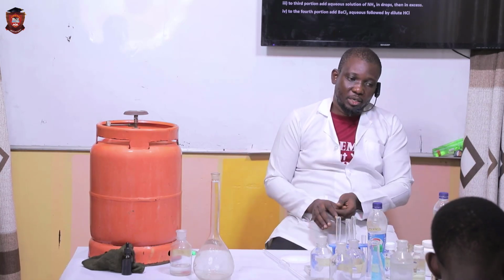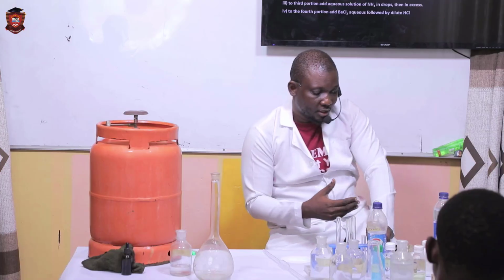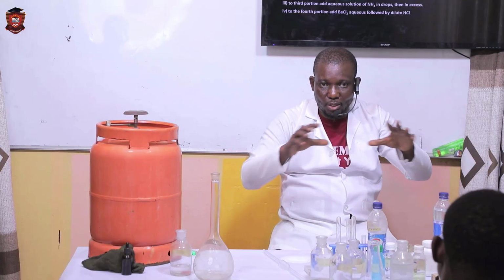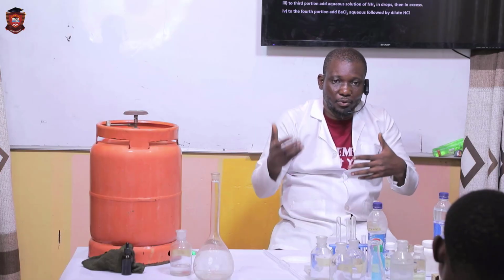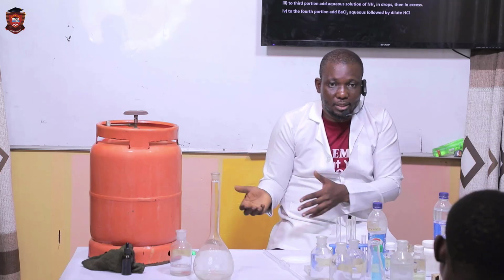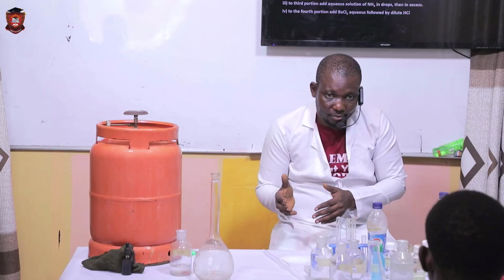Before we start the experiment, there is one part to this particular question, which is on the board, that I would like to explain before I put it in the table, just the way the WAEC will always ask students. They will say that every one of your practical observations or inferences should be in table form under the subheadings tests, observation, and inference.